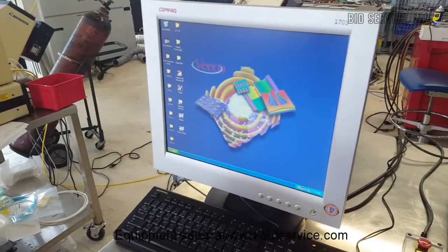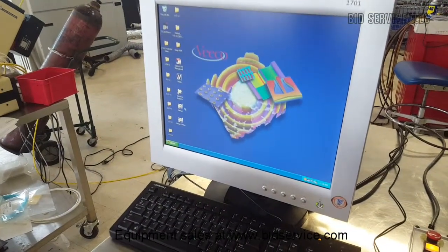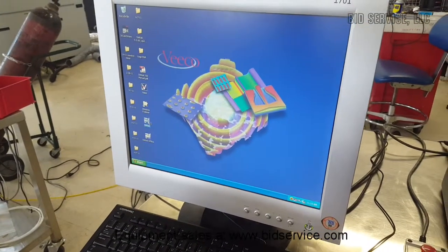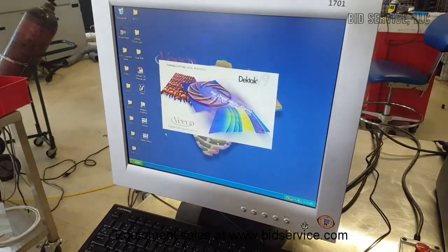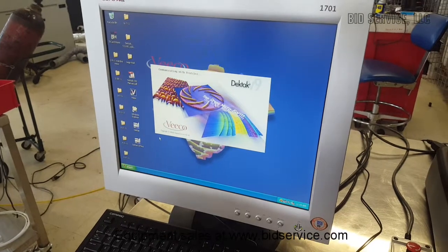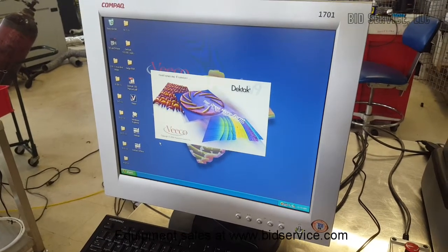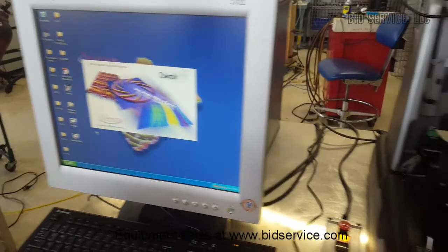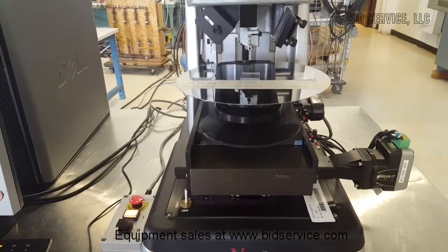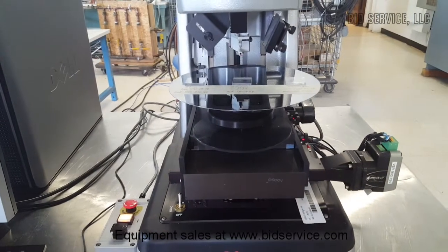So this is the screen it will boot up to, and you just have to go into DECTEC version 9 software. It will initialize. I'm running the system without the environmental shield so you can see the operation.